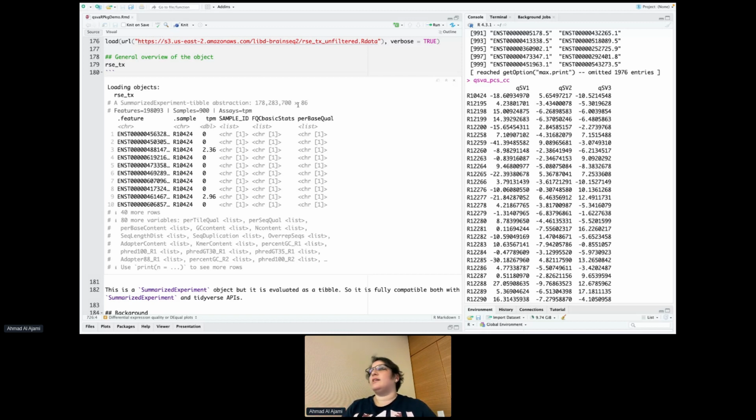How do you choose those degradation genes to get those SVAs? You choose some genes to calculate those components. You have 25 components. How do you choose those genes? Do you have some ground truth? How do you run the SVA? From the cell component model, we joined the main and the interaction, so we have 1700 transcripts when you run select transcript. What's the meaning of those components?